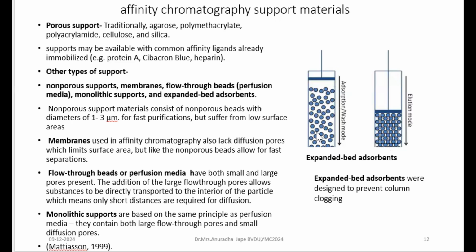So when the column is allowed to develop, at that time you are going to have the expanded bed status. But when you are going to elute, you are going to press it. Generally, as I said earlier, many times you work with very long columns and those with very small size particles, because the smaller the spherical particle, the better the surface area, so separation is going to be better. But it is going to get affected by the clogging problem. Its own pressure is going to clog its sites of action, and separation or partitioning will not be efficient. So this clogging problem can be avoided if we take help of expanded bed adsorbents.